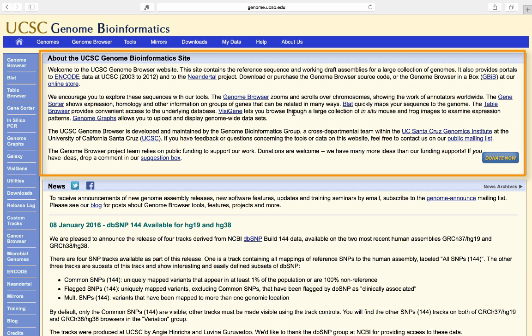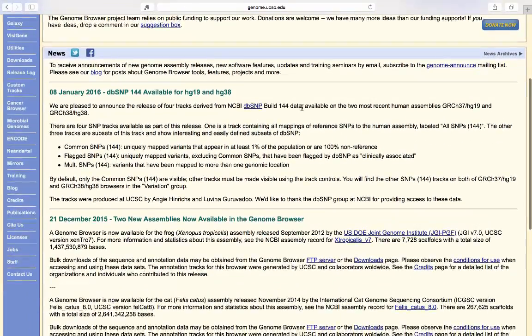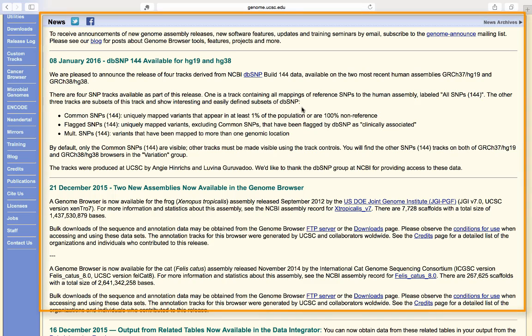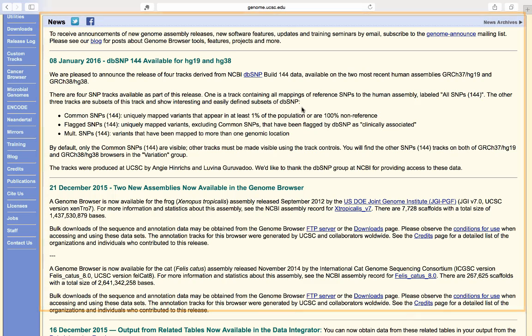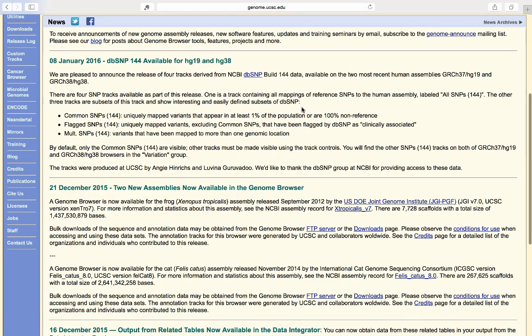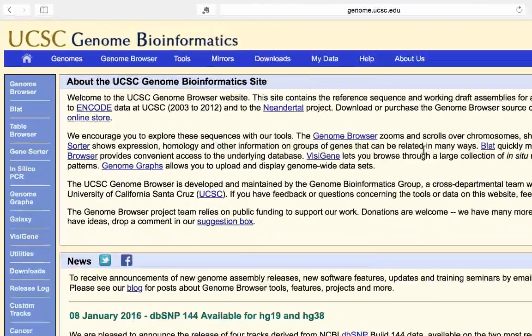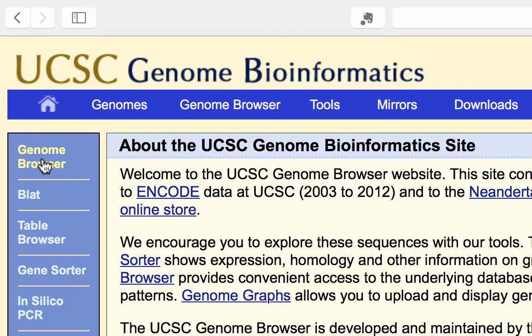At the top of this page there's an About section that contains information about the page and links to various tools. Below that, there is a News section with information about new releases and new annotation tracks. On the top and left side of the page are links to tools related to the Genome Browser. We'll get started by going to the top left and clicking Genome Browser.